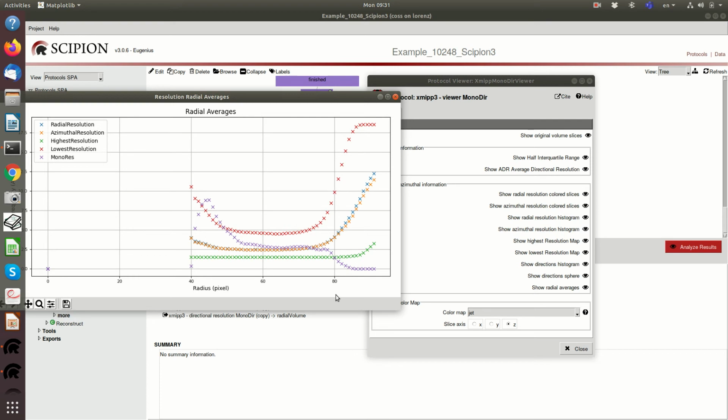The beginning and the end of this plot is not significant for the apoferritin because it has very few voxels. So this is where the apoferritin starts appearing, and then at this point it starts disappearing. And the interesting part is the middle one, so the ones that are fully filled with apoferritin.